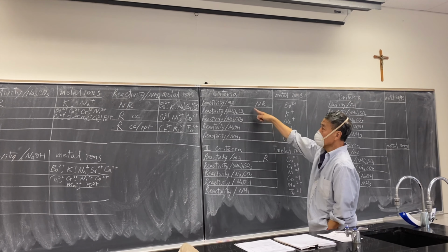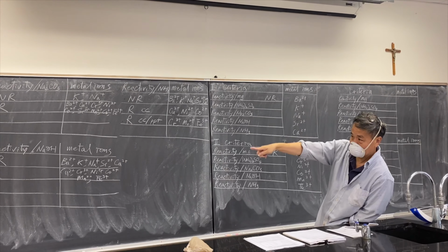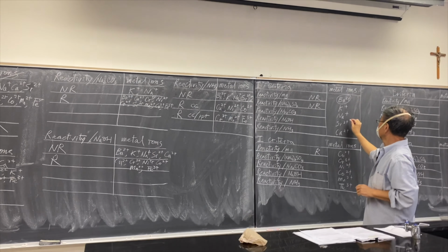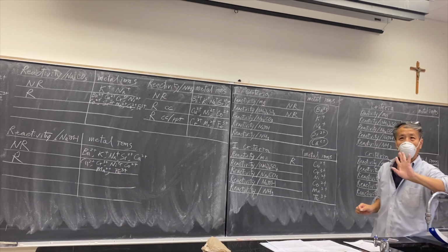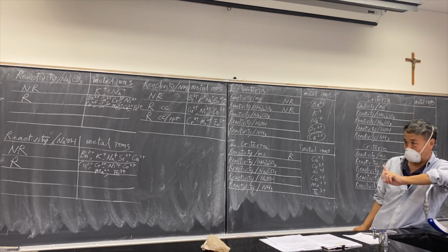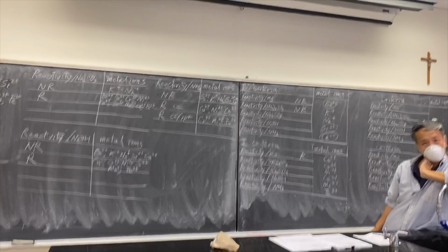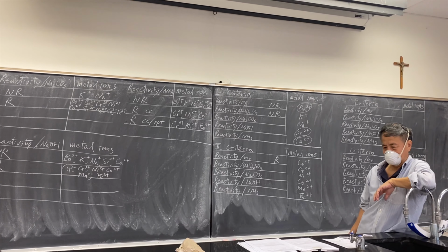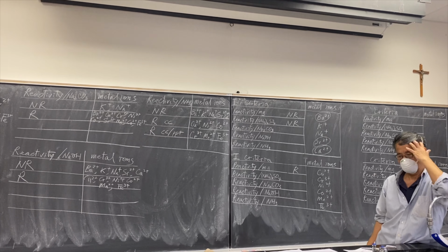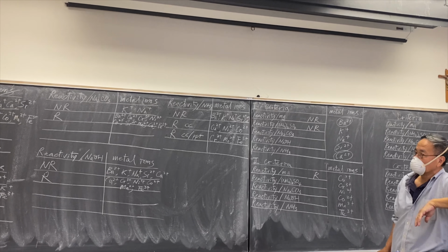Second one, reactivity with our ammonium sulfate. Look at your page 50 for ammonium sulfate. There is no reaction, or NR, listed first. So we will give that criteria to the first table on page 53. We see a few of the elements do not fulfill this criteria.